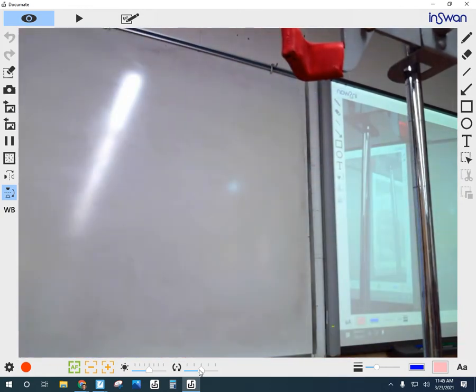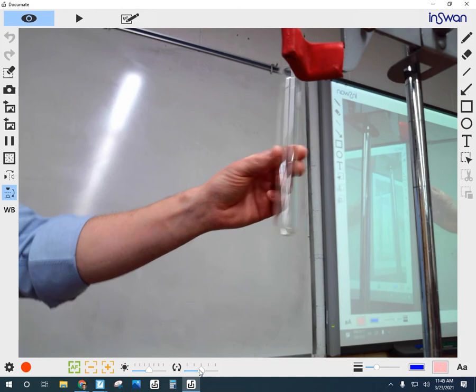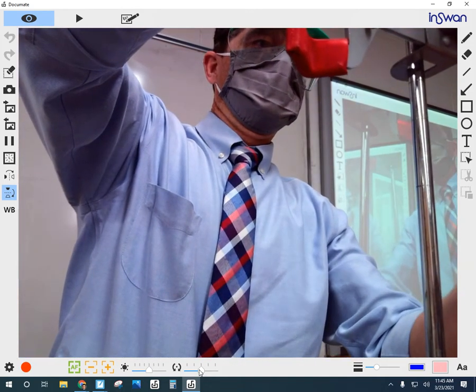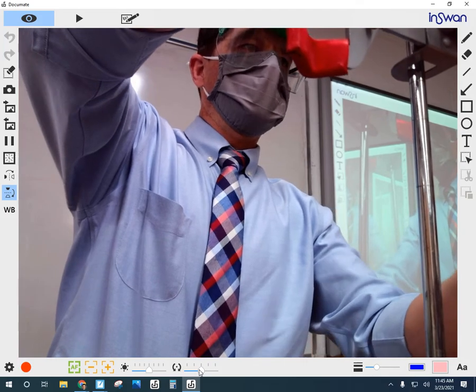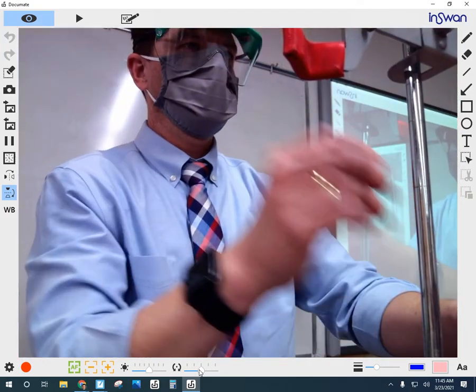And I also want to show you that reaction one more time, but I want to scale it up a little bit and go with a bigger test tube, right? Because bigger is always better. So again, I'm going to collect some hydrogen gas. It is still bubbling away pretty well here.